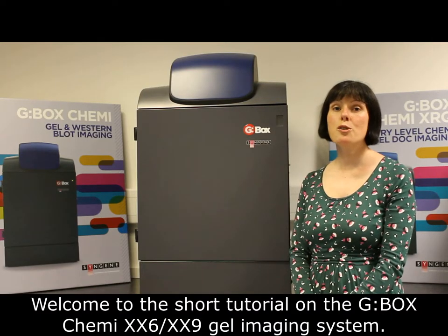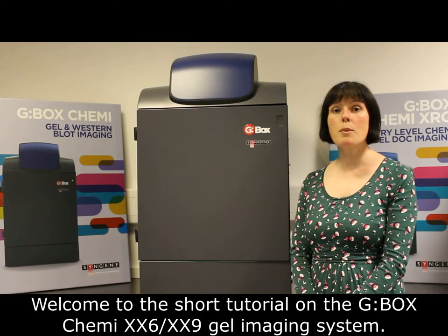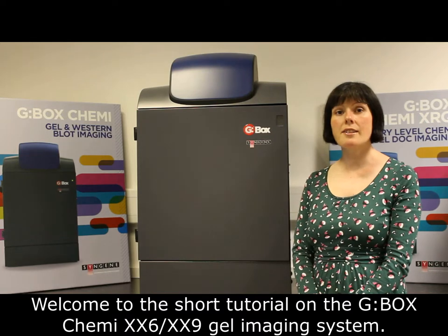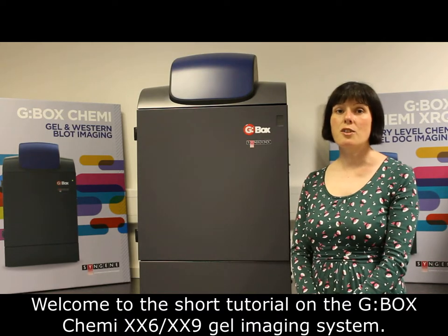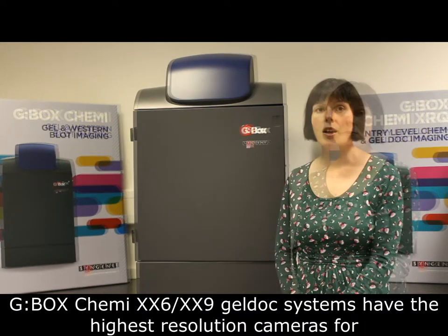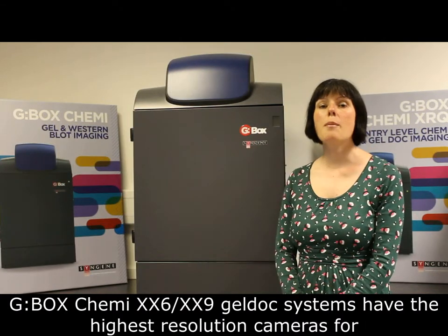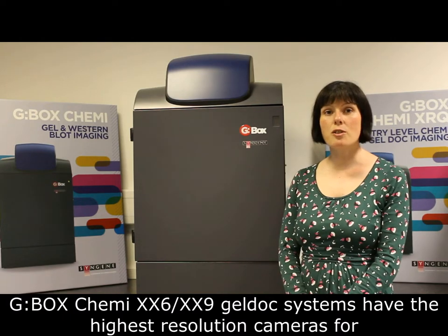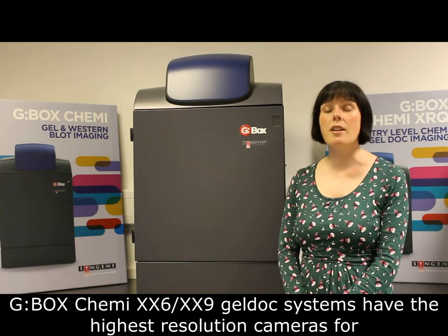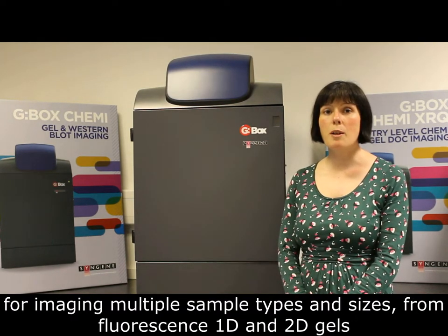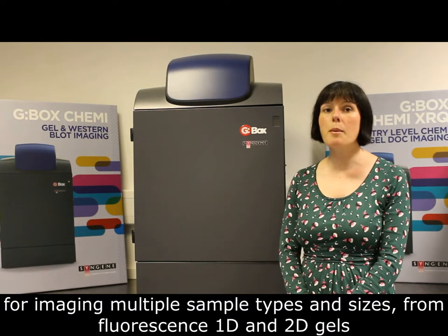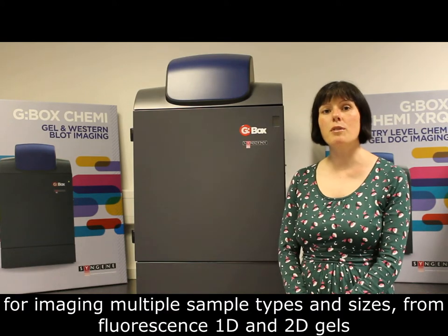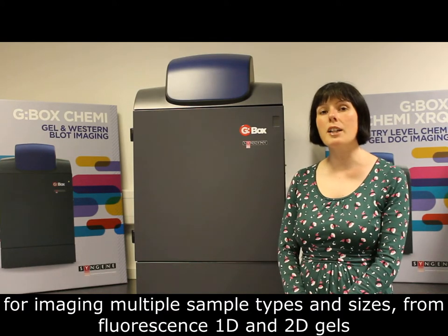Welcome to the short tutorial on the G-BOX CHEMI XX6-XX9 gel imaging system. G-BOX CHEMI XX6-XX9 gel doc systems have the highest resolution cameras for imaging multiple sample types and sizes from fluorescence 1D gels.